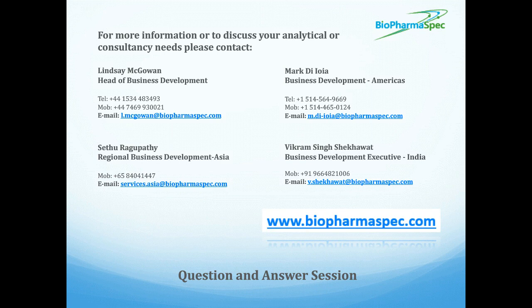Great, thank you. Okay, I think we've got time for one final question then. And the last question of today will be, does a product-specific cell lysate need to be used for every project, or can a previously characterized library be used? Do you have a previously created generalized library to use?